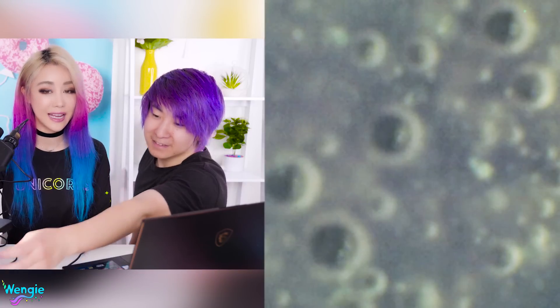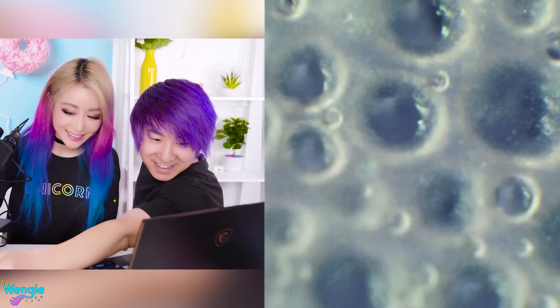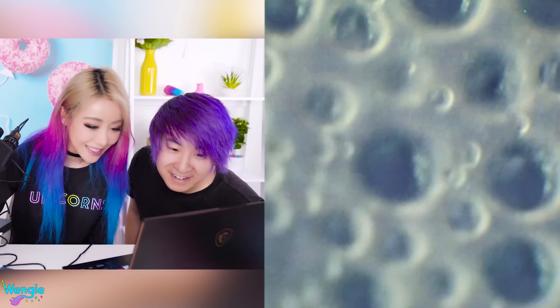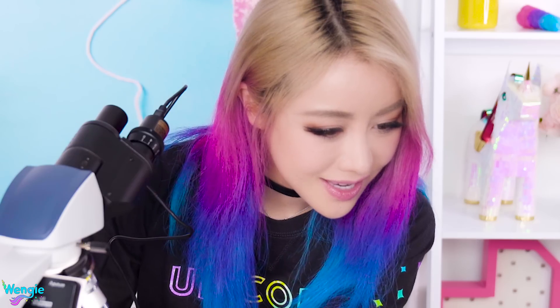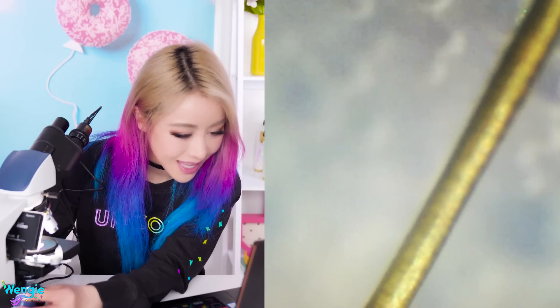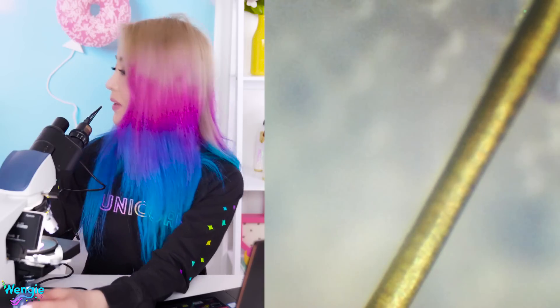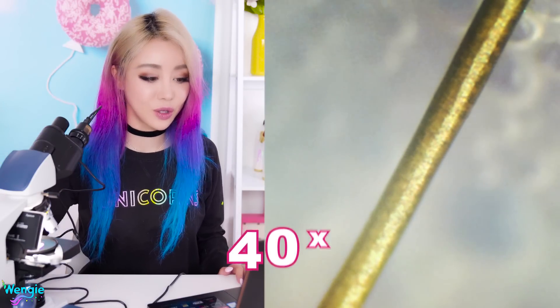It literally looks like I put googly eyes on slime. After refocusing the microscope, it looks even more disgusting! What is that yellow thing? It looks like gold thread — I think that's Mia's hair. If only this was real gold, I could totally sell it. You know what? We're actually only on 40x zoom. Looking at this hair, we should be able to see more detail. So let's have a look at what it looks like under 100x zoom.